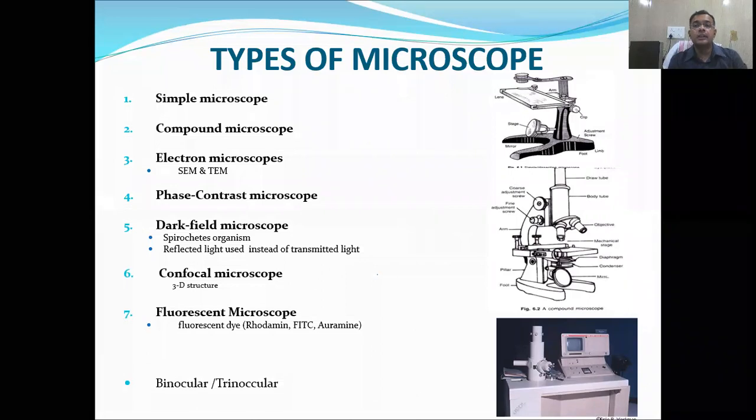Generally the normal microscope has a 10x eyepiece and a 100x objective piece, meaning 1000 times magnification. But the electron microscope has 1 lakh times higher magnification and resolution by replacing the normal light with an electron beam, and it has a different lens than the ordinary microscope. They have electromagnetic lenses, and that improves their resolution and magnification power.